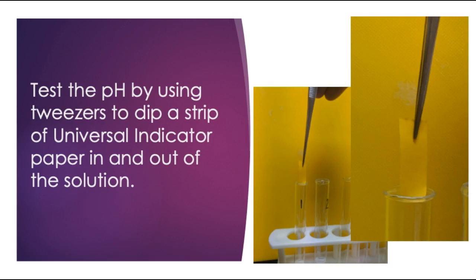Next, whether it's dissolved or not, you then need to test the pH. You have to grab out one of the pH test papers. Now, don't tip them all out on the desk. If they get any liquid on them, you ruin them. So one at a time, pull out a clean piece of paper with your tweezers like this. And you've got long tweezers for a reason.